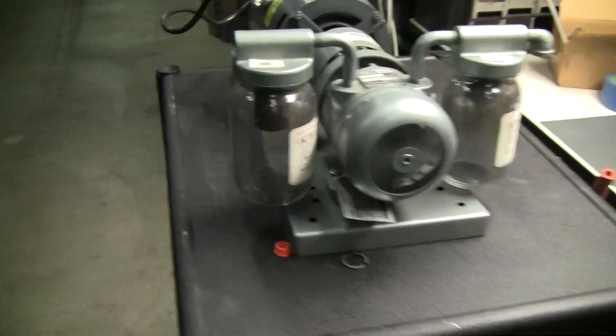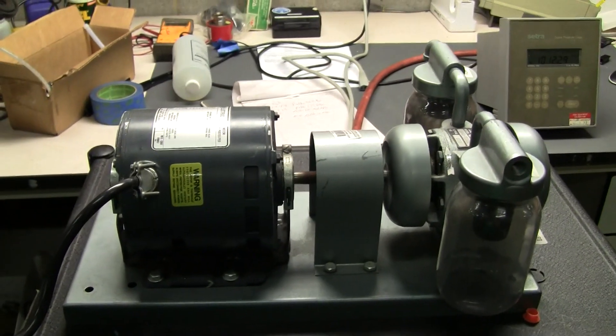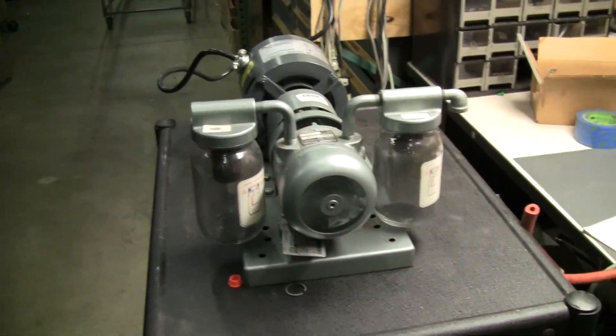Nice and quiet. If you have any further questions about this pump, please don't hesitate to call 609-518-9100. Thank you again from HitechTrader.com.